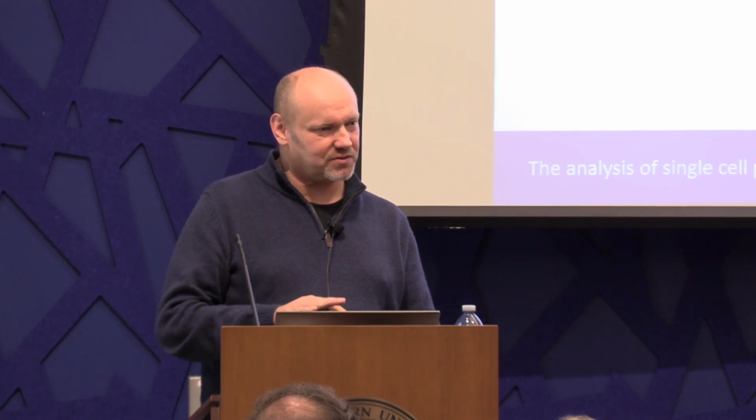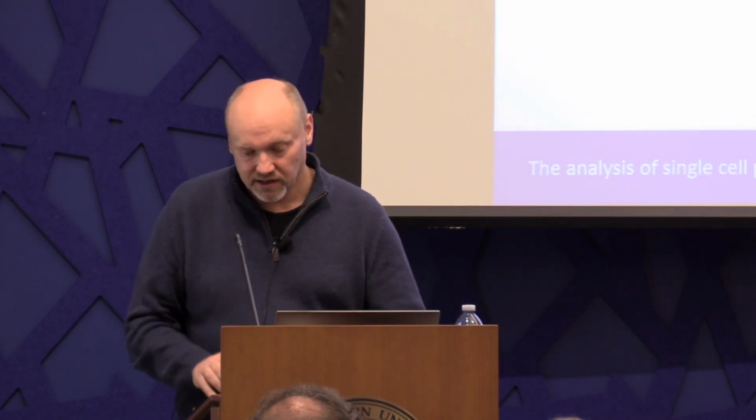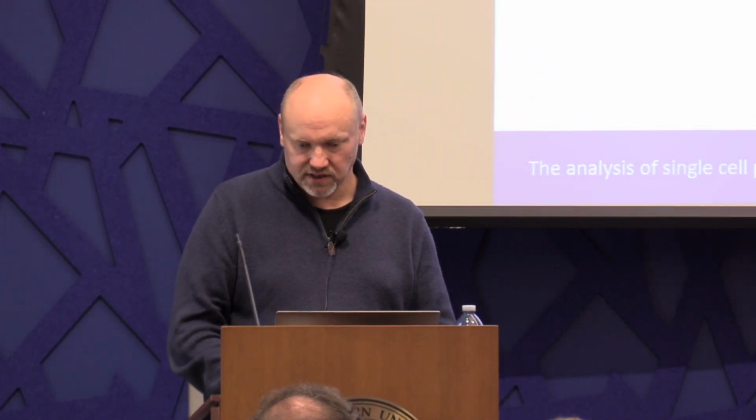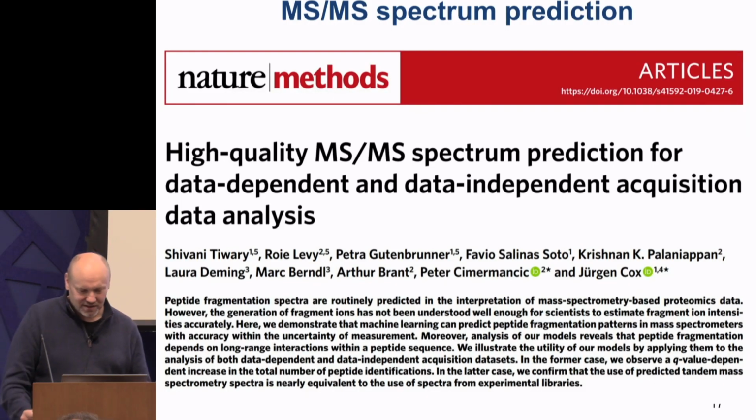So now I want to get to a completely different topic, which, however, will also be very helpful for single cell analysis, which is the prediction of MSMS spectra. That's a more progressed topic. It was just published 2 weeks ago here.